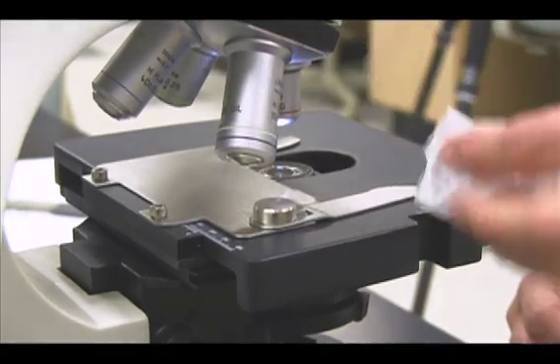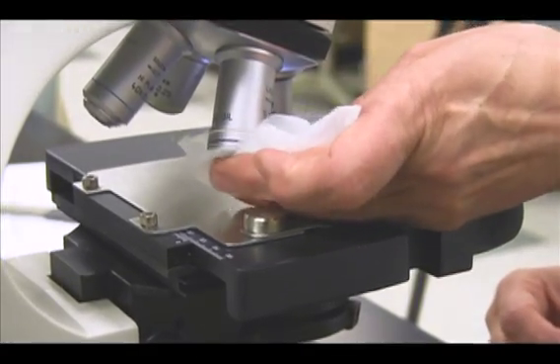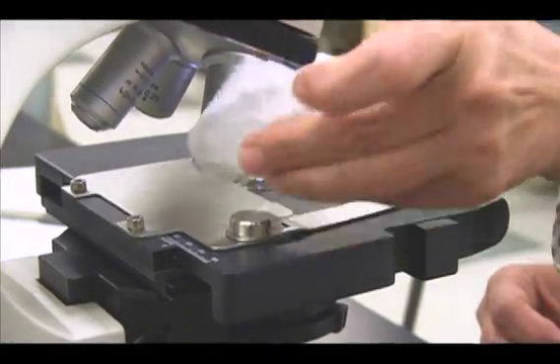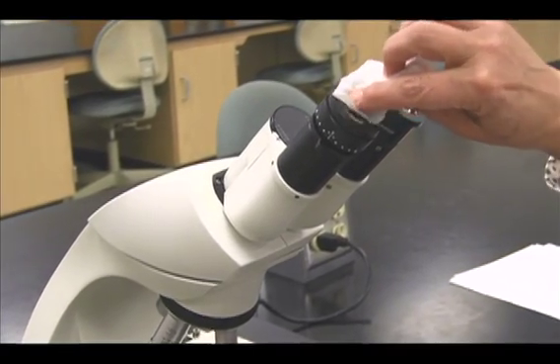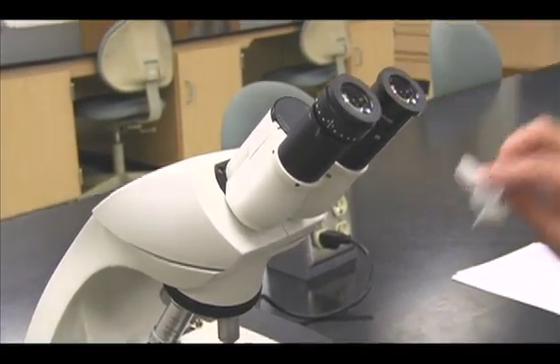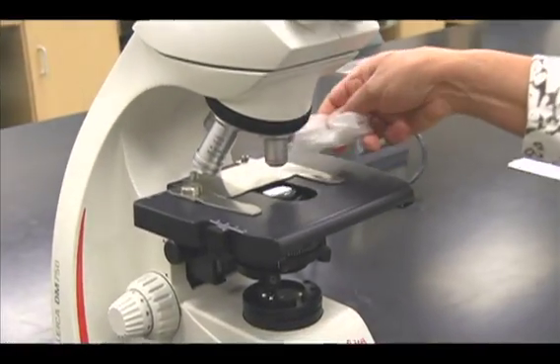Clean all of the oil from the 100x objective with lens paper. Use a clean sheet of lens paper to clean the rest of the lenses on your microscope.